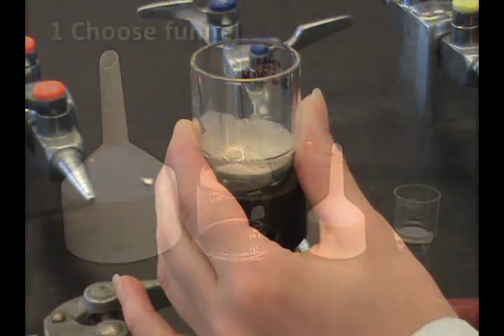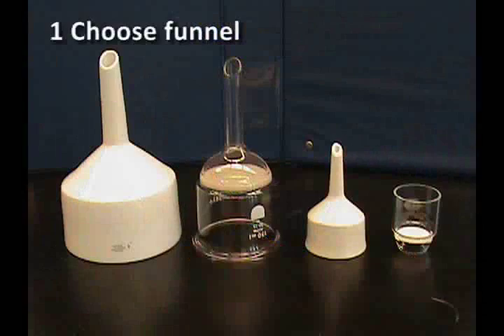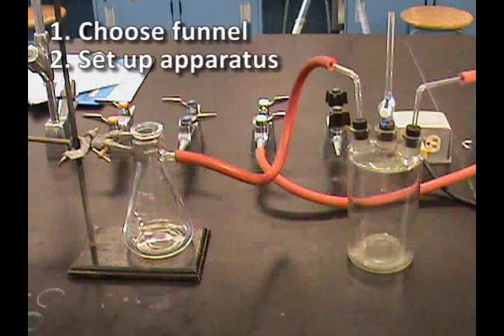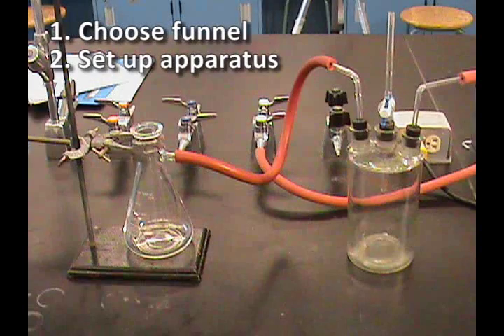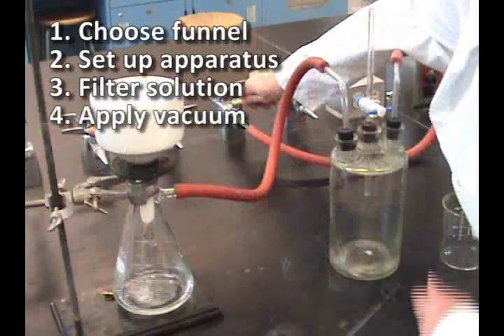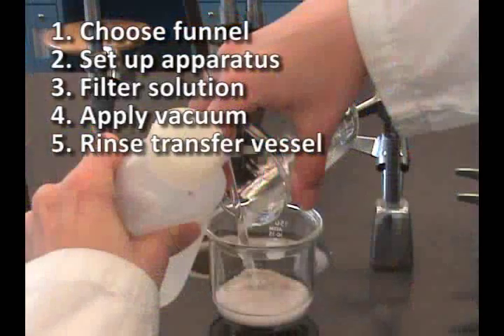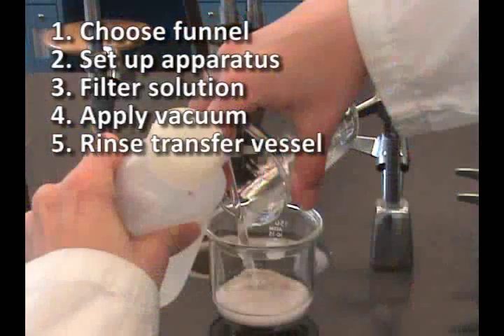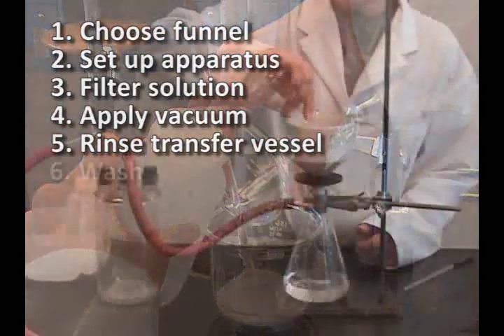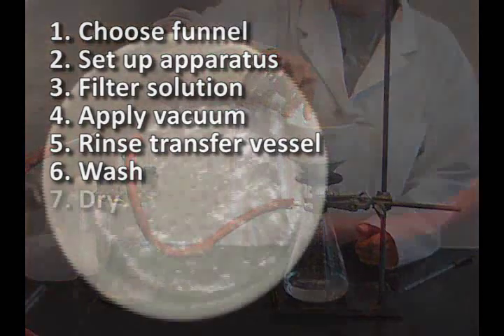Let's review the steps. Choose the type of funnel required. Set up the vacuum apparatus. Filter the solution. Apply partial vacuum. Rinse the transfer vessel and use a policeman to help transfer the solid if needed. Wash the solid two or three times. Let dry for 10 minutes with vacuum on.